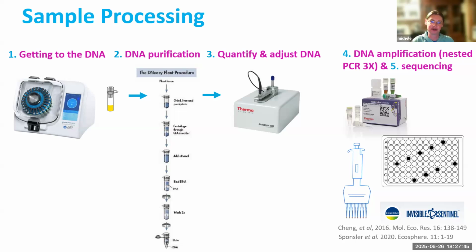The tubes look just like this, but they have teeny tiny 1 millimeter chrome beads. They go in this machine, and basically this shakes the snot out of them. Again, this is the loudest, most obnoxious piece of equipment I have. And this is by far the 7-year-old's favorite machine, because it's super loud and kind of scary, actually, if you ask me. But the machine is breaking up, what we would call lysing, the cell. So you're breaking the cell open to get at the DNA, which is what I'm after, because that's what I'm going to use to identify the plants that are in the sample.